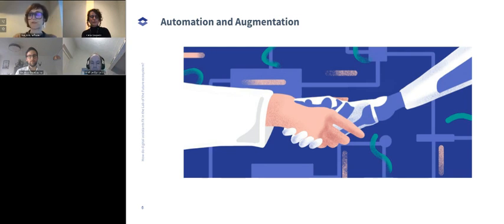For example, transferring samples from one well plate to another, and transferring that protocol from one being executed by humans to one being executed by a robot. And in that process of programming, experimenting and fine-tuning the settings, the automation engineer first of all needs to document it. While documenting, he also needs to keep an eye on how the robot is executing it.